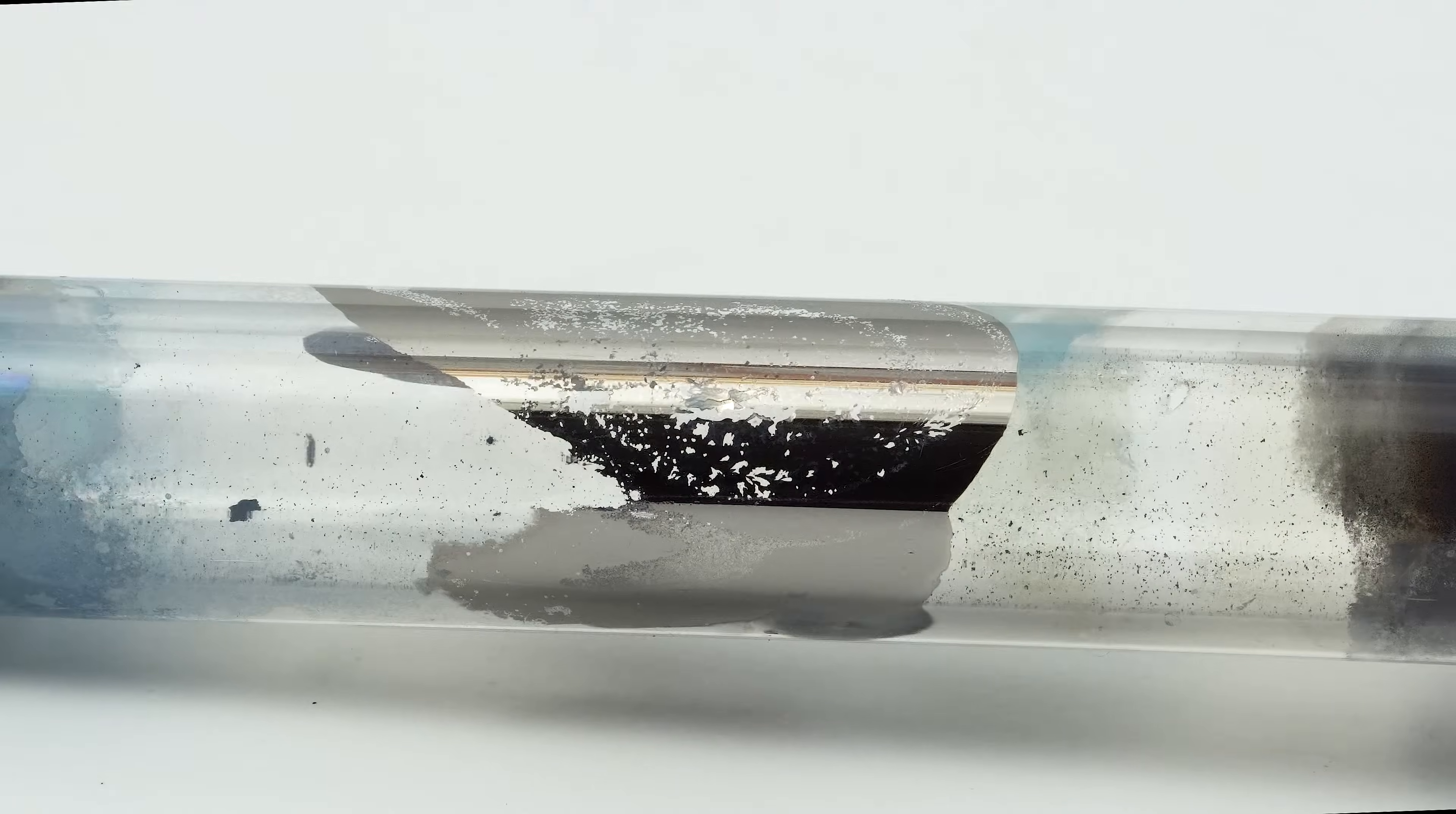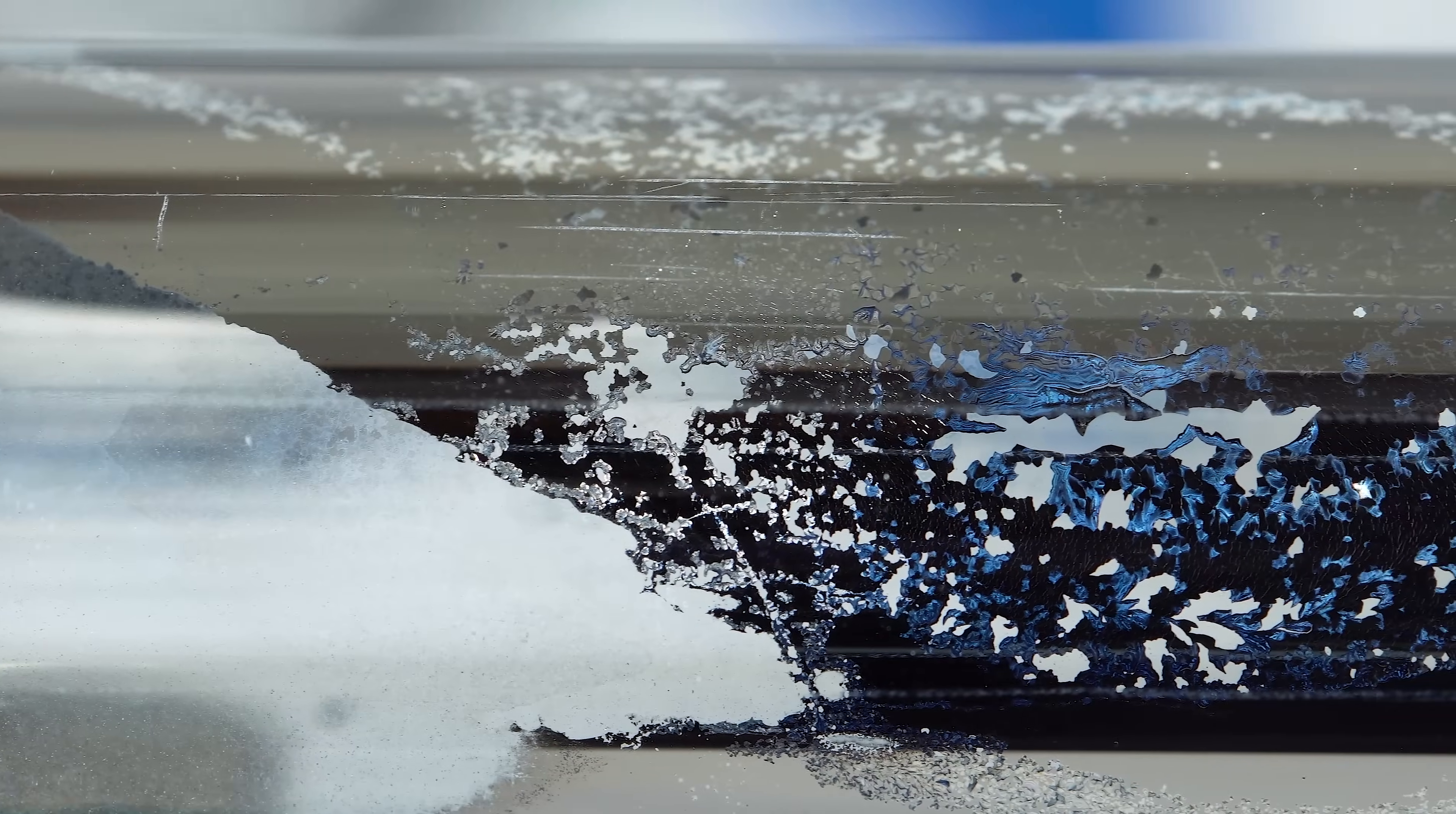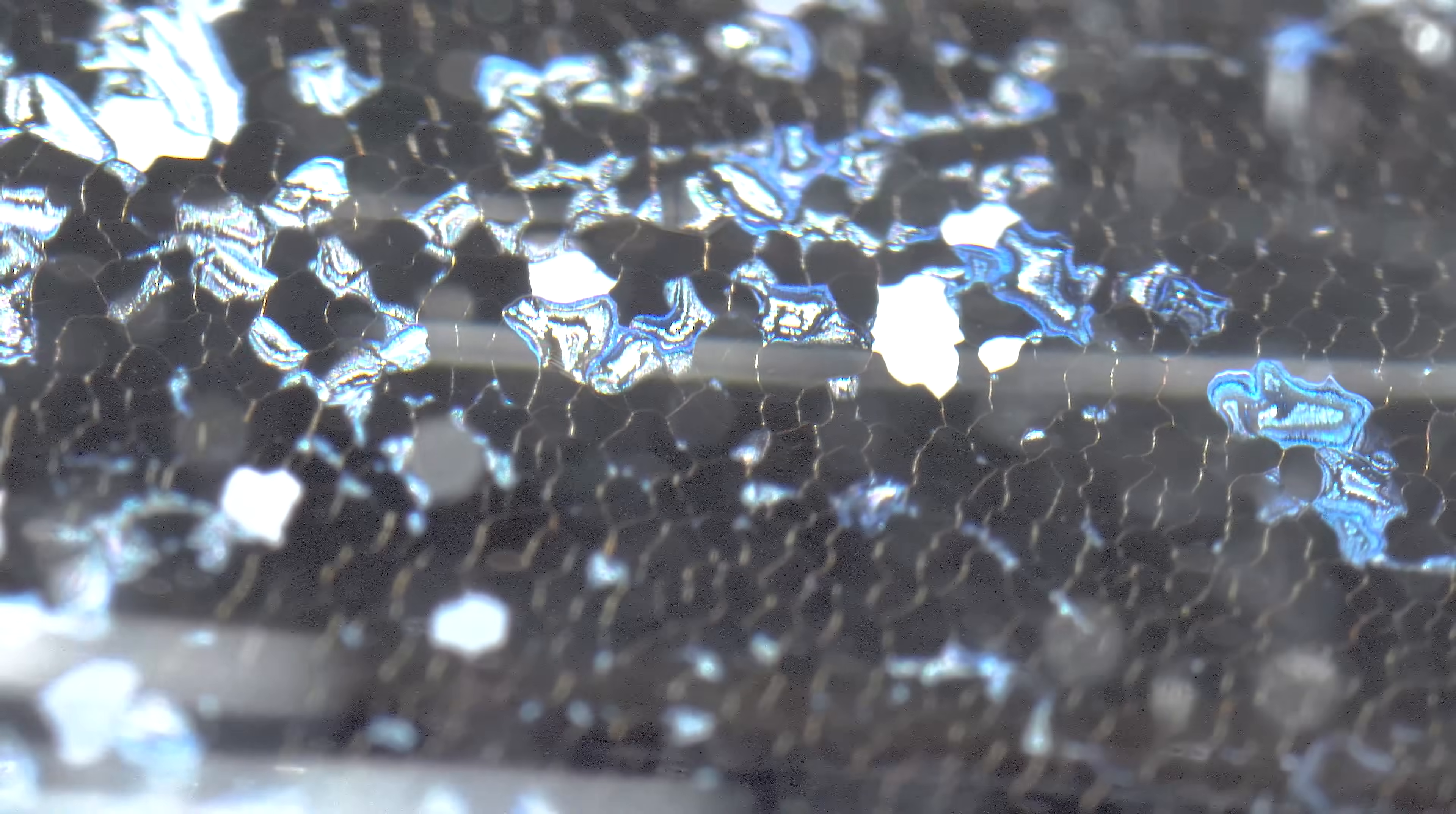After all the tungsten hexachloride was used, we got this tungsten mirror. Unlike a perfectly pure tungsten hexacarbonyl mirror, the tungsten hexachloride mirror may display bluish tint in certain areas due to impurities of reduced tungsten compounds, which can affect the coating's quality.